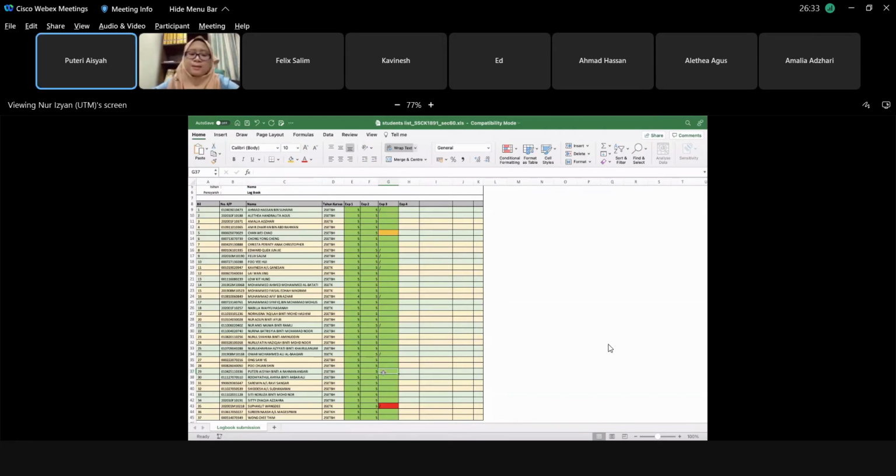Hello? 100 ml. 100 ml is not correct. 100 ml is the volume, not the concentration. Okay, it's okay.